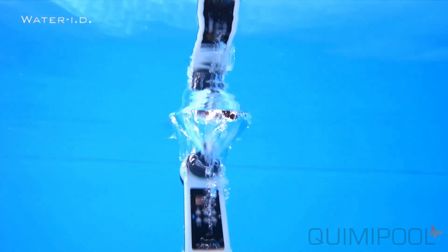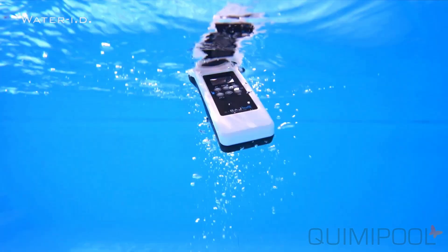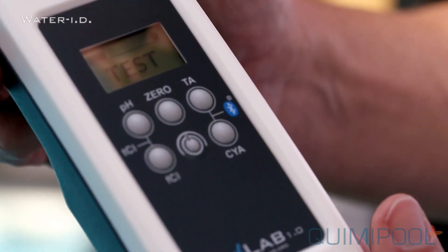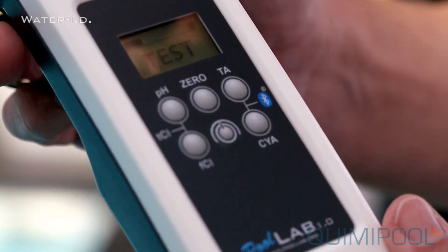The PoolLab is IP68 waterproof. The built-in measurement chamber can be exchanged. Six buttons allow direct access to all 11 parameters.